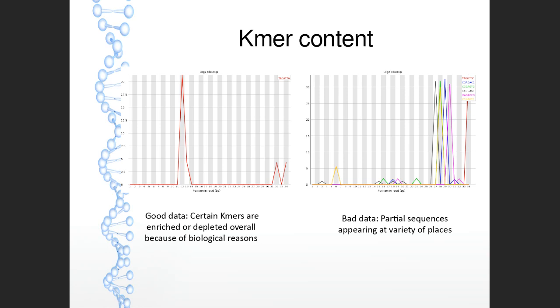But taken all in all, those are all of our metrics. Now, as we go through these in FastQC, you'll see that FastQC gives us a tick or a cross next to these, whether it thinks that the quality is acceptable or not. We have to use our intuition and look at this whole report in a holistic manner to decide whether our data is of a decent quality or not. We can keep looking at examples of good and bad quality data, but you do have to use a little bit of biological intuition.